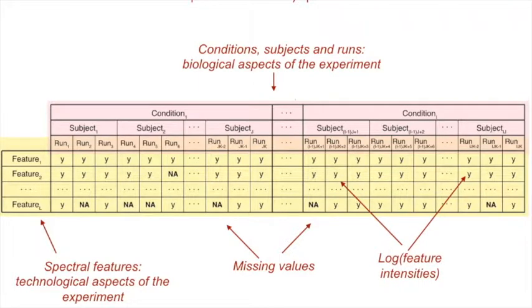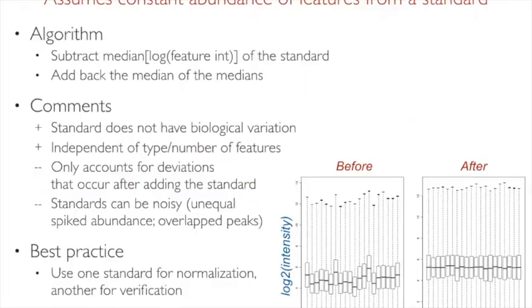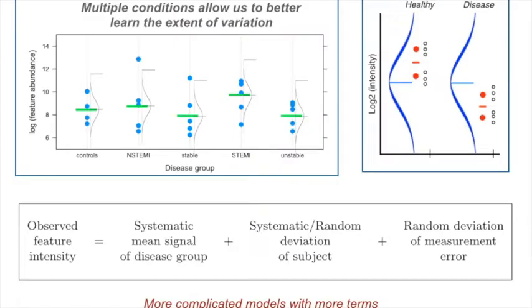Everything I will talk about next is about one protein primarily, but you can just imagine that we iterate over every protein one by one in the data set. Okay, so if you were here last week, you remember that we talked about the fact that we can extend two-group comparisons by t-test for more complex situations. And so this was one of the slides that I showed.